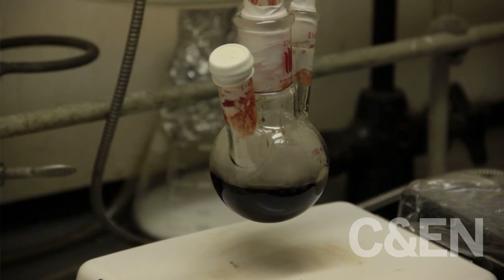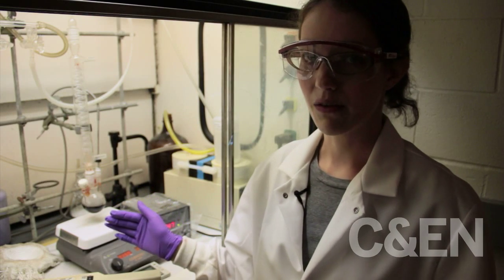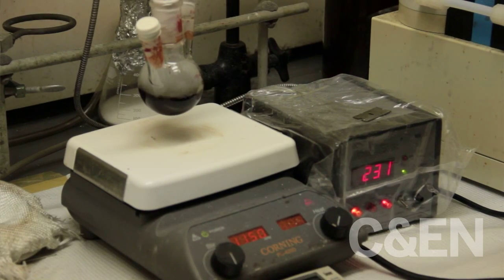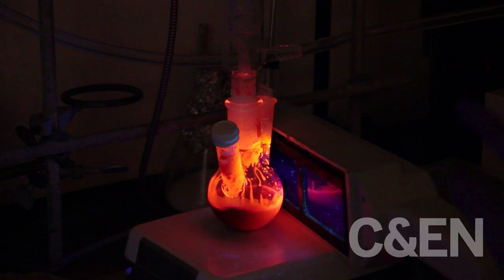At this point, the quantum dots have annealed, so now we are able to just cool them down to a temperature where we can clean them. As they cool, they get brighter. The reaction is over. If I excite them with the black light, you can see that now they fluoresce. At the lower temperatures, we're able to see the color much more clearly.